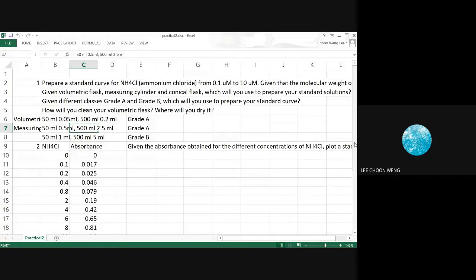Okay, and of course, single beam is a lot cheaper than a dual beam system. A dual beam system can easily be 2 times or 3 times the price of a single beam.